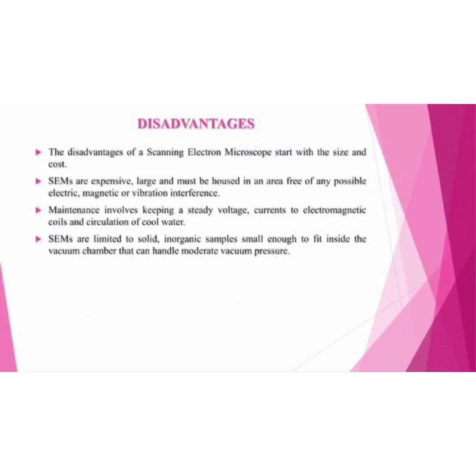Disadvantages. The disadvantages of the scanning electron microscope start with size and cost. It is large and must be housed in an area free of any electronic, magnetic or vibration interference. Maintenance involves keeping a steady voltage, currents to electromagnetic coils and circulation of cool water.